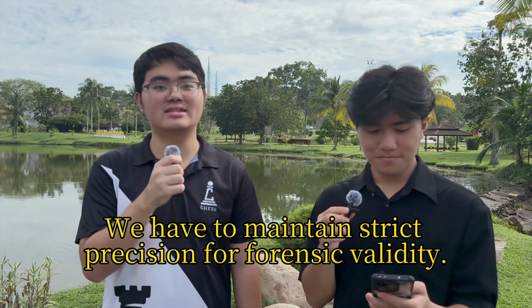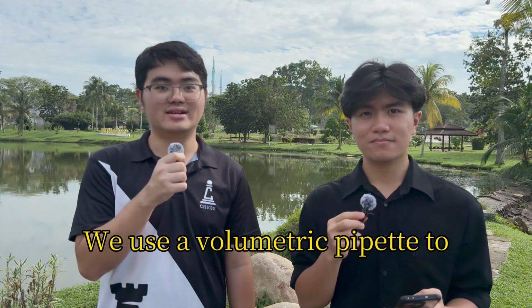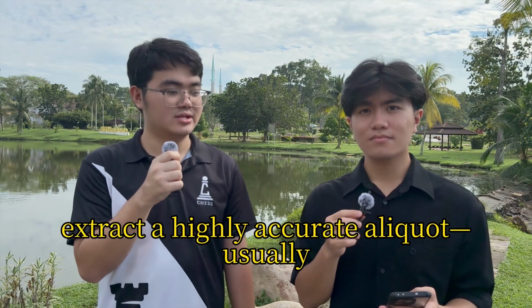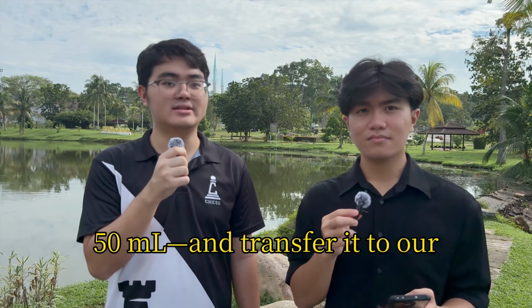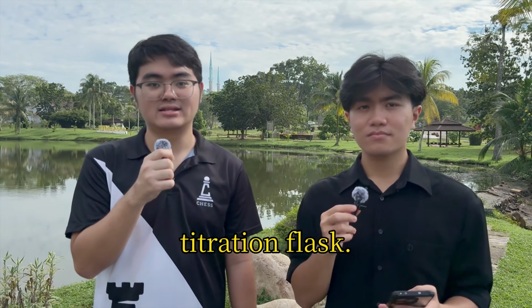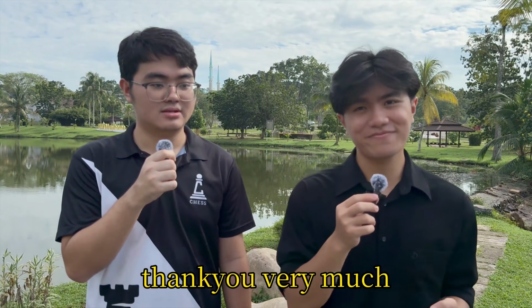So we have to maintain strict precision for forensic validity. We use a volumetric pipette to extract a highly accurate liquid volume, usually 50 milliliters, and we transfer it to our titration flask. Then it's ready for analysis. Thank you very much. Thank you.